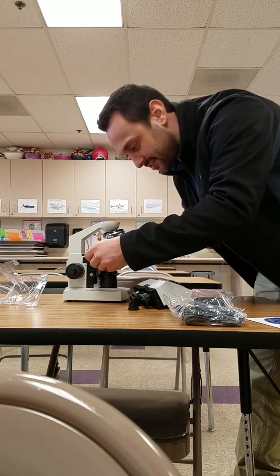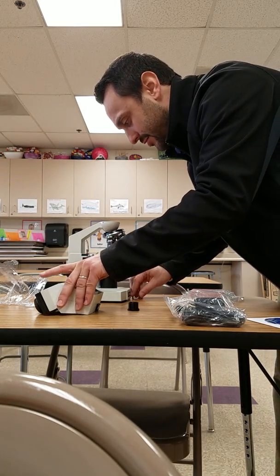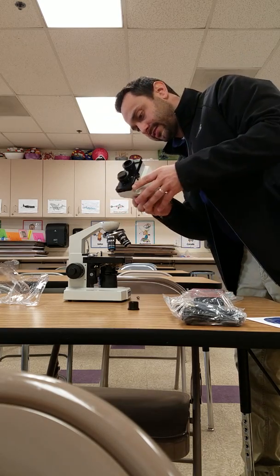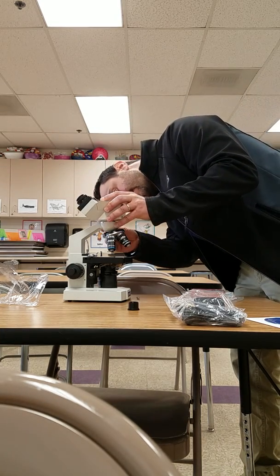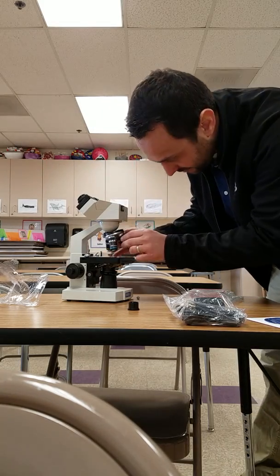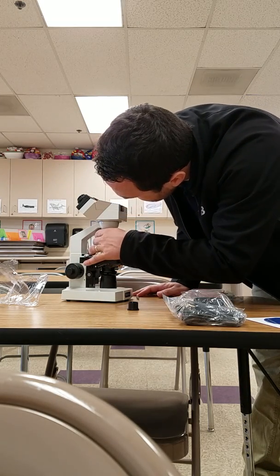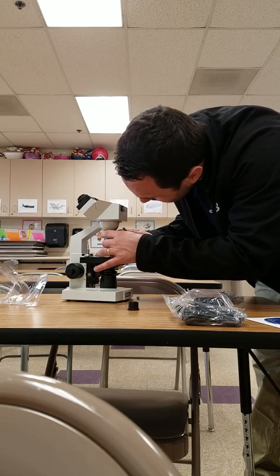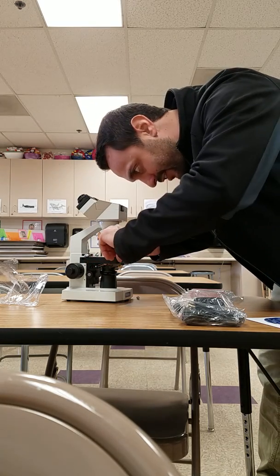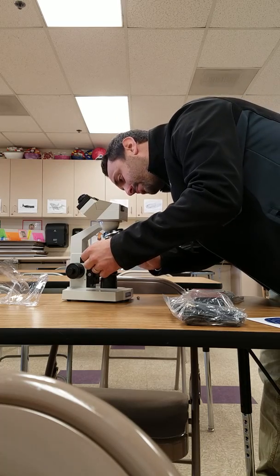It looks like the stage has these micro-adjusters on it, so you can move your specimen around. I guess the lenses point that way, and I'm trying to understand how that works. We're going to have to play with this a little bit just to figure out how it works. And we've got some more plastic junk.